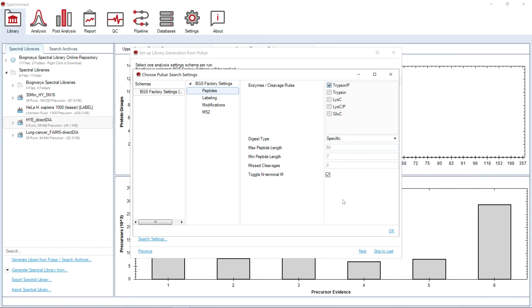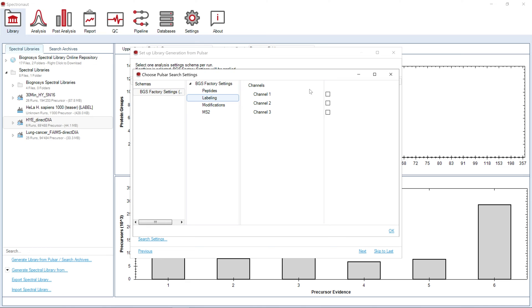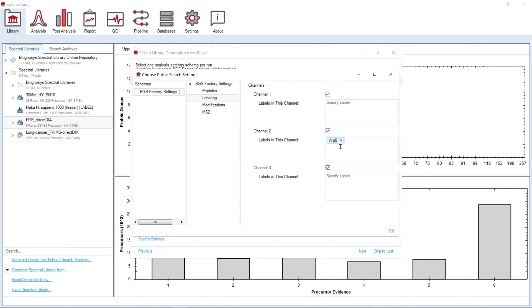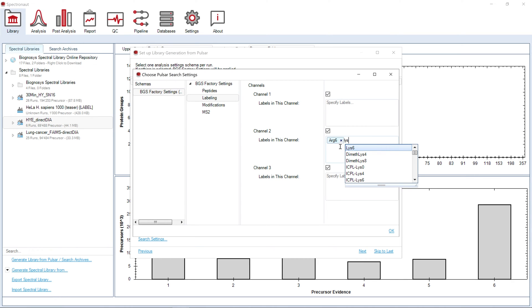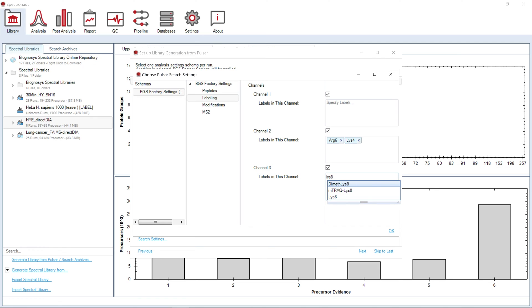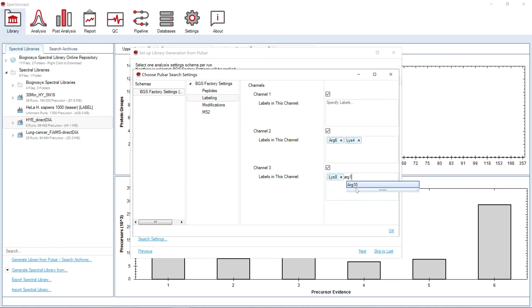In the labeling node, you can specify peptide labels if you use any for your experiment. For example, you can specify SILAC labels: first the unlabeled channel, then the medium channel, and finally the heavy one. In case you are performing a label-free experiment, you should leave all channels empty.